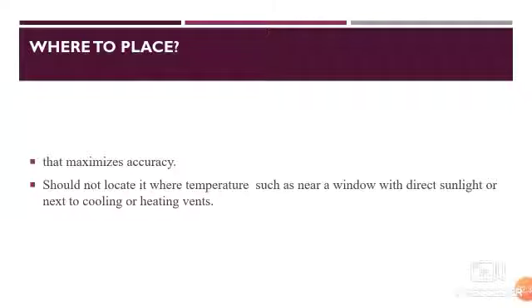We should ensure our analytical balance does not have direct exposure to a window. It should not be located near a window where there is direct sunlight, or next to cooling or heating vents. If you have a window, obviously there will be sunlight, and because of that there will be fluctuations in temperature. For example, if you want to measure a powder, if there is more humidity, air flow, or other disturbances, your measurements will not be accurate. We should keep the balance in a place where sunlight, air flow, and dust particles cannot enter.